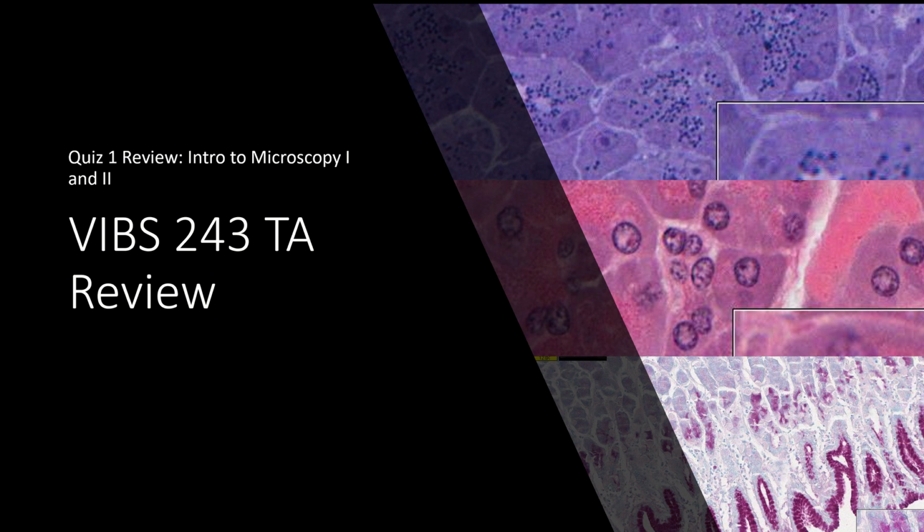So this is just getting you used to what we're going to be looking at for the rest of the semester, and how we can actually study tissues and cells on a cellular level. Because that is the basis of this course. That's how we do histology.